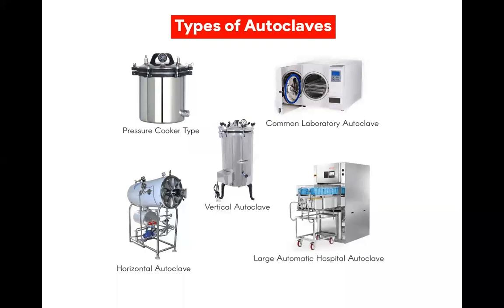That is how a level 3 lab works. For a level 4, it's even more strict because it is vacuum controlled. There's a vacuum, there's a pressure system. So the air in that lab cannot even exit into the environment. So for the items that need to leave that lab, after you're carrying out different procedures in the lab, you're done, they need to go through that process where you kill all microorganisms that may be present. Those autoclaves are built into the wall. You put the items in and you get them in the next room when they are decontaminated.